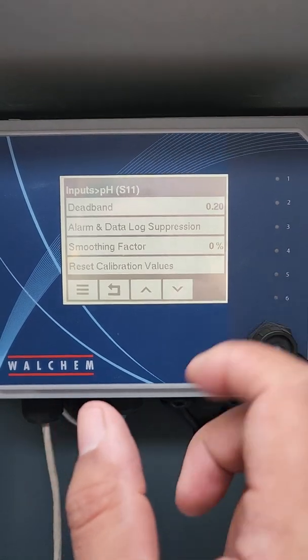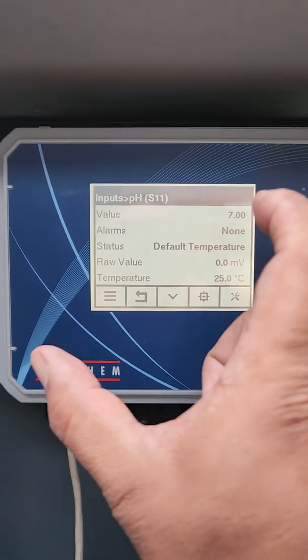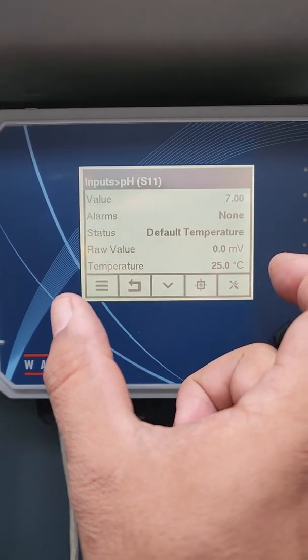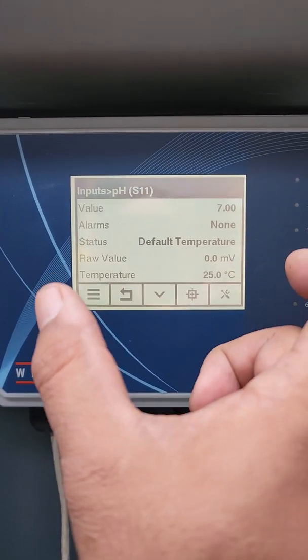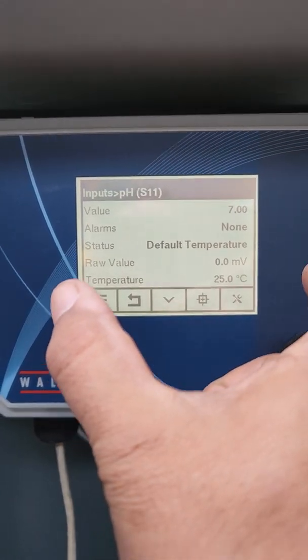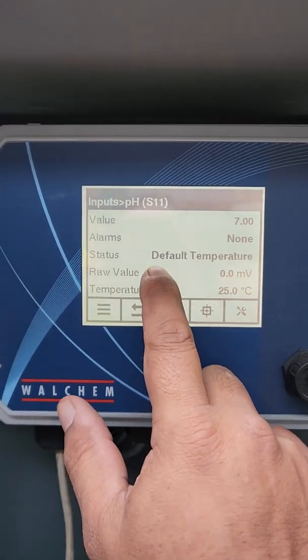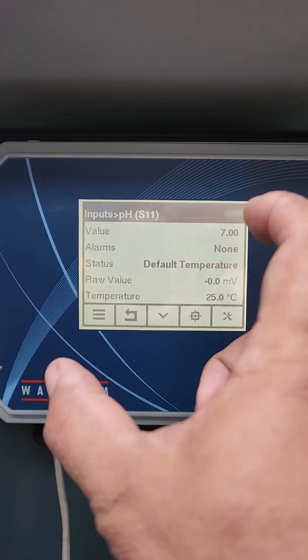the slope, because every time we go back and press calibrate for a probe, what we're actually doing is, if this from my thumb to my finger is the line, that's good. What happens after a while is it drifts off like this, and what we're doing by pressing calibrate and going with the buffer solutions is we're actually telling the controller in the background to make an adjustment back to good. And so we're shifting this angle here, and the slopes are being moved, and the amount that it's moved is displayed in a percentage when you're calibrating, and that's what that percentage means, is that we're fudging the factors by XYZ%.